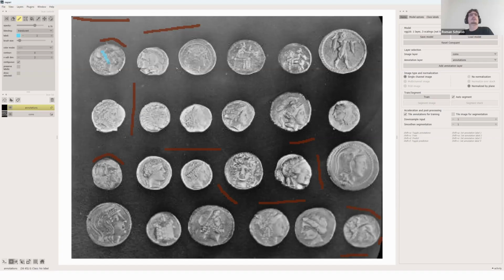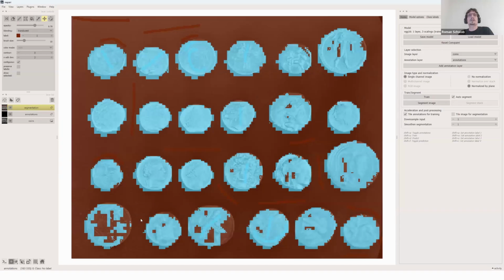And now, oh, that was too far. Let's just see what happens. Yeah, so we need to add some more here.